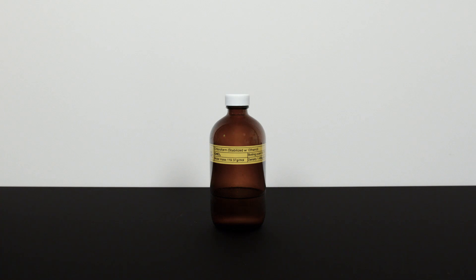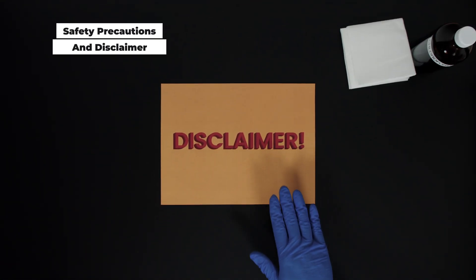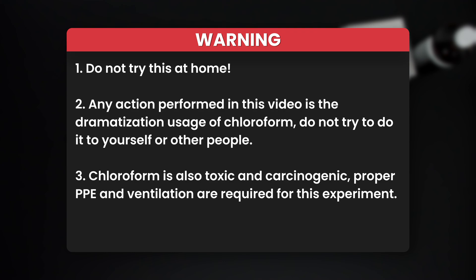To find out why, we first have to make some chloroform. But before that, a quick disclaimer: do not try this at home. Any action performed in this video is a dramatization of the usage of chloroform. Do not try to do it to yourself or other people. Chloroform is also toxic and carcinogenic — proper PPE and ventilation are required for this experiment.